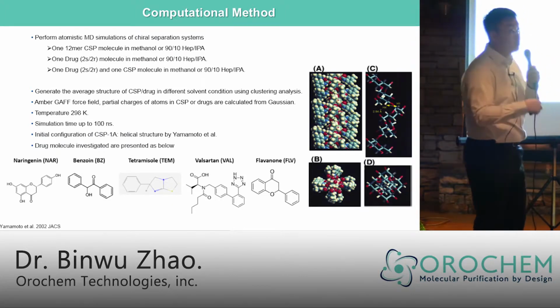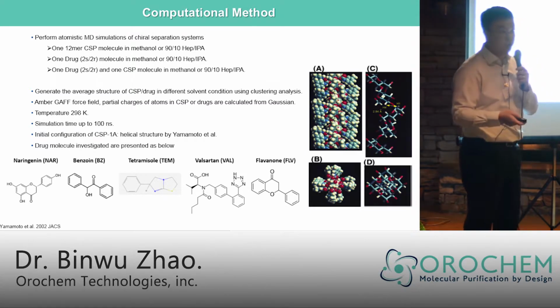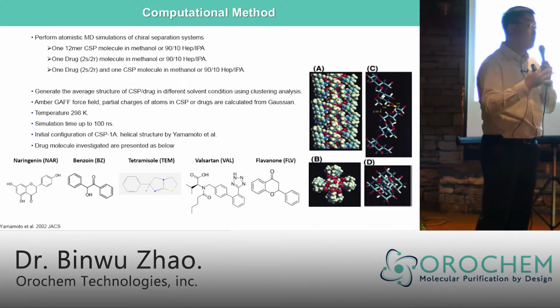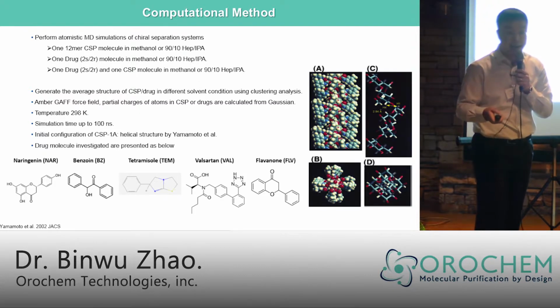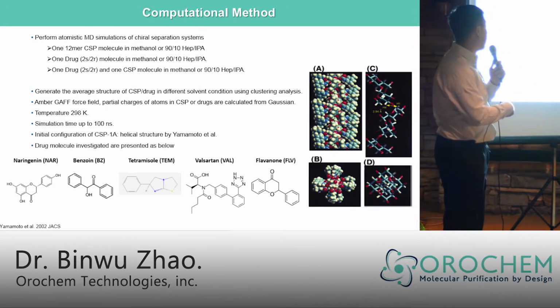And Amber here is the molecular dynamics engine software that we're using, and the force field is called GAFF. All the partial charges on both the CSP and drug are calculated via quantum chemistry using Gaussian. The temperature is around 298 K, and the simulation lasts 100 nanoseconds.